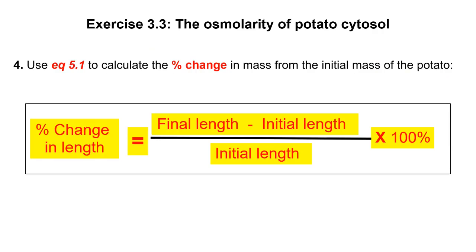And at the end, you just have to apply this formula. If we are not in person, you will apply this formula that is final length minus the initial length. If we are in person, we will use just the weight instead of the length, and the formula is in your lab.